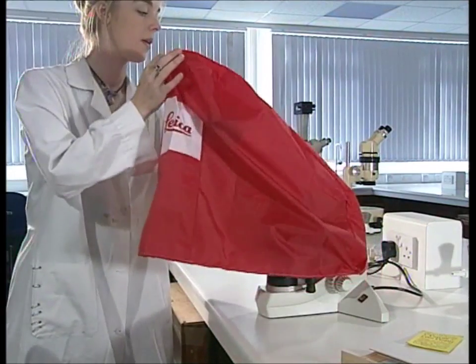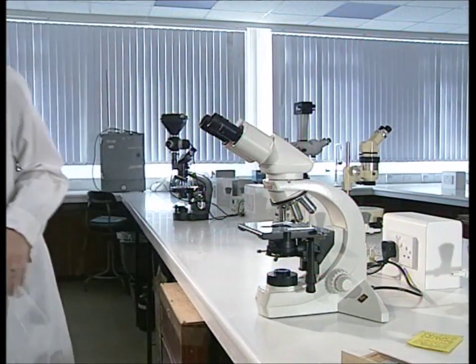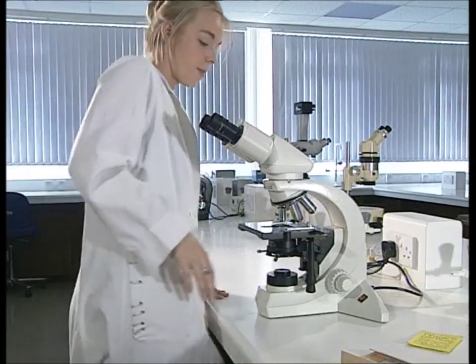The basic design of the microscope is similar in all cases, and we can demonstrate it with this standard bright field type.